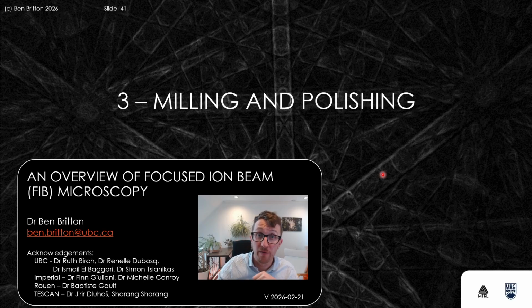This is my third lecture of an overview of focused ion beam microscopy. In this lecture we're going to explore focused ion beam milling and polishing of surfaces. Of course, I have to acknowledge significant input from a range of colleagues who have helped advise and share slides that have supported the generation of this slide deck.